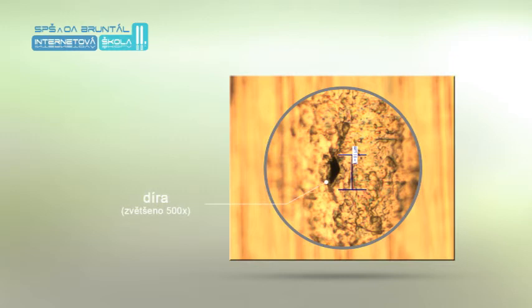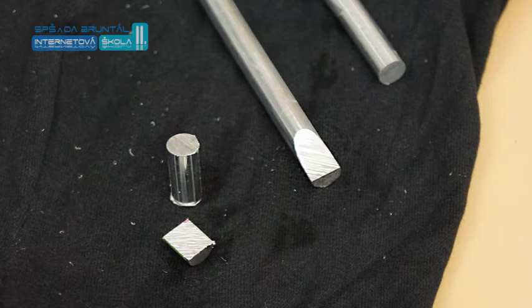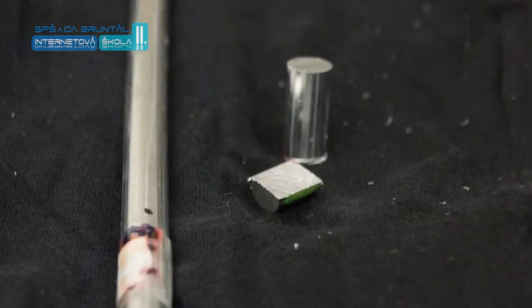In the image we have a sample with 500x magnified cracks, which appear as dark black areas. At 50x magnification, the sample surface is examined via monitor and eyepiece. Locations with defects are identified and images are created for further observation. Now we'll look at some microstructures.